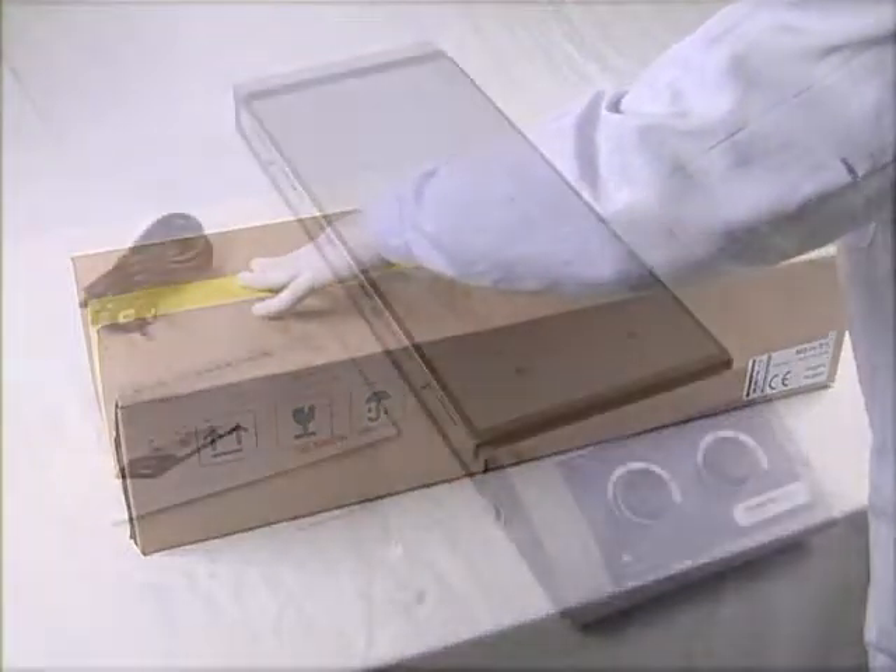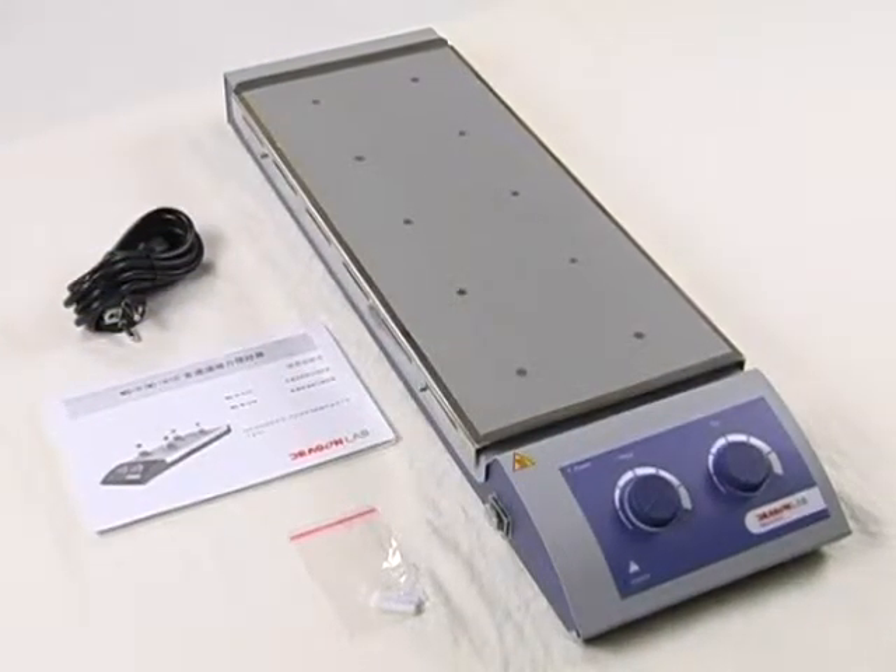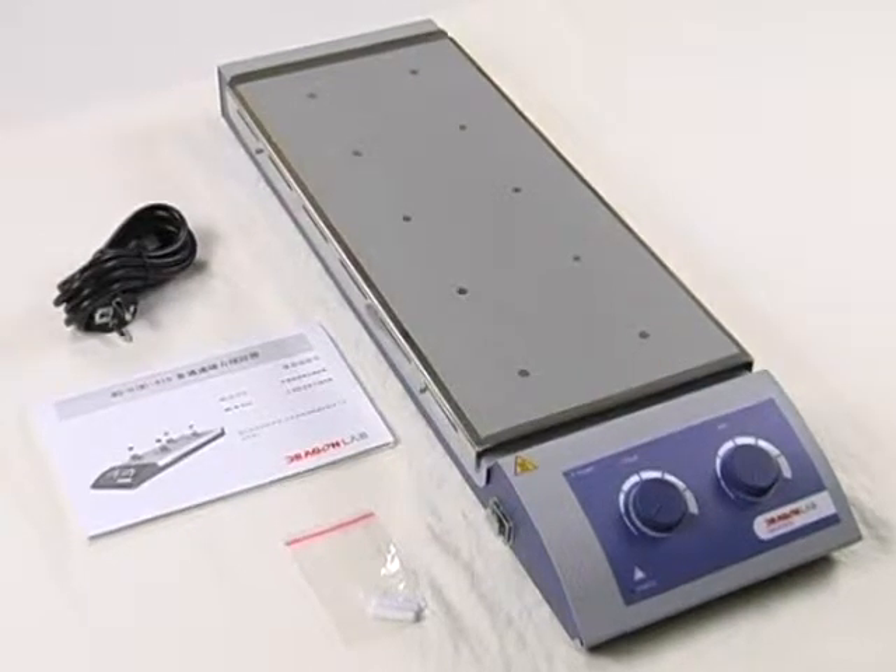Inside the packaging: one 10-channel analog magnetic stirrer unit, one power cable, one user manual, and stirrer bars.